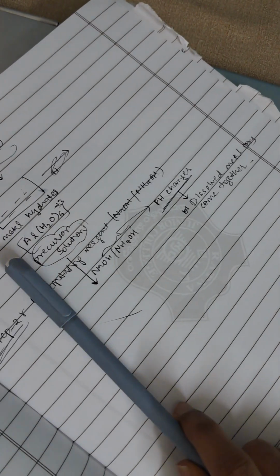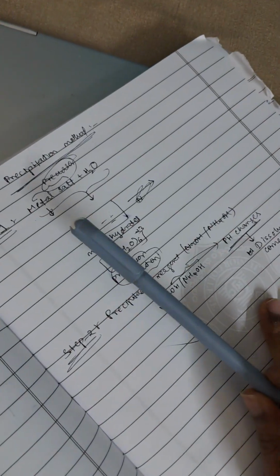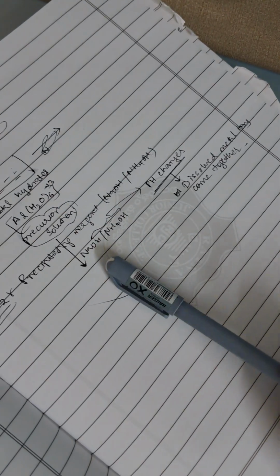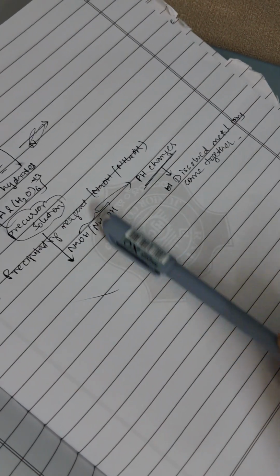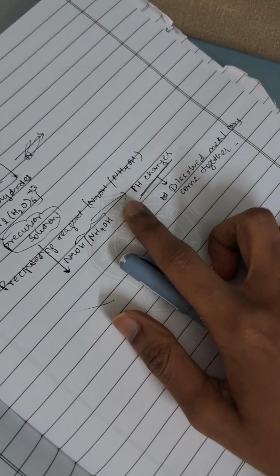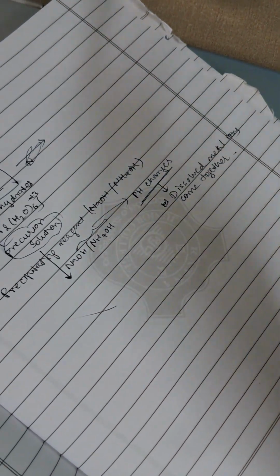and form a solid. So here, first the metal salt precursor dissolved in water forms metal hydrate. Next we need to add NaOH or NH4OH precipitating reagent so that it forms a precipitate. Here the pH changes, and as the pH changes, dissolved metal ions come together.